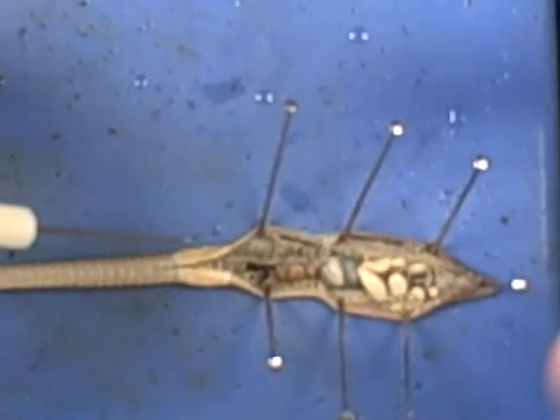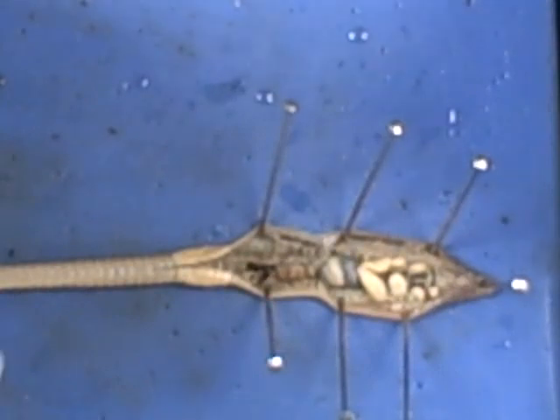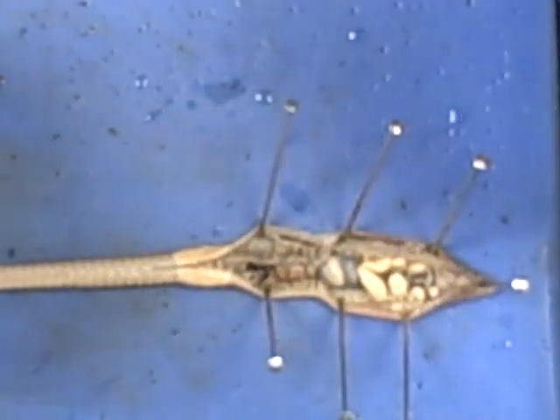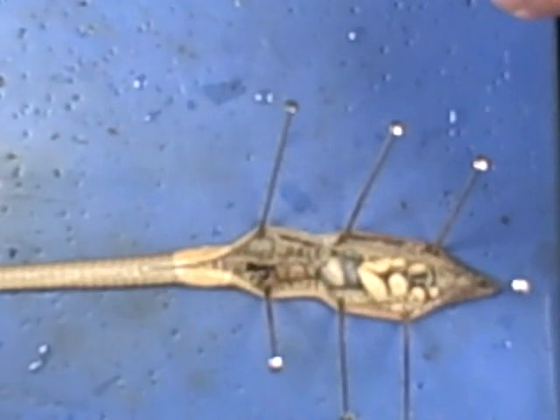Once you are complete and finished answering your questions, make sure you pull the pins out and put them back in the tray where you found them. Clean out the tray itself, get any juices out, wash it, dry it, stack it. Then take your worm and throw it in the trash.